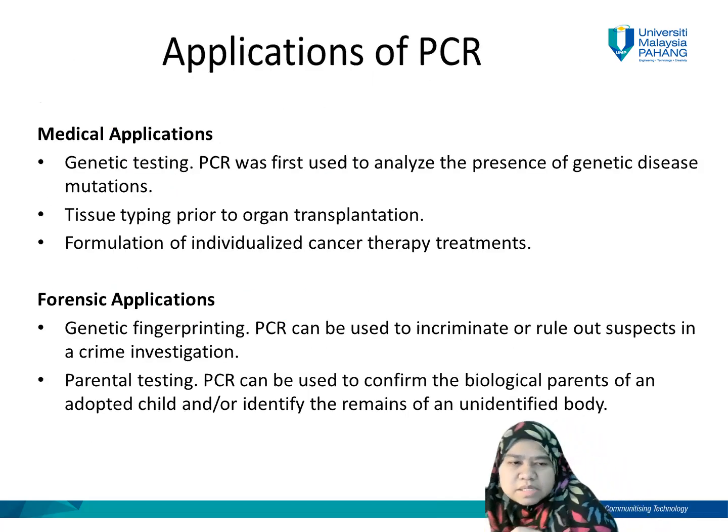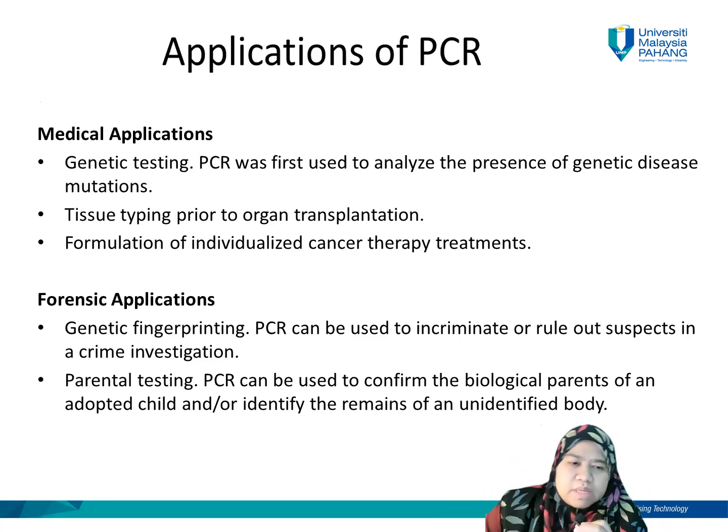There are many applications for why you want to use PCR. Medical applications: genetic testing to see the presence of a genetic disease mutation, tissue typing prior to organ transplantation, and formulation of individuals' cancer therapy treatments.